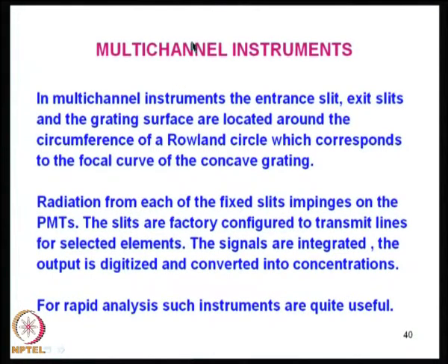Now we move on to multi-channel instruments. In multi-channel instruments, the entrance slit, exit slit and the grating are all located around the circumference of the Rowland circle. We have to always assume that we always work on the Rowland circle in ICP. The Rowland circle corresponds to the focal curve of the concave grating.